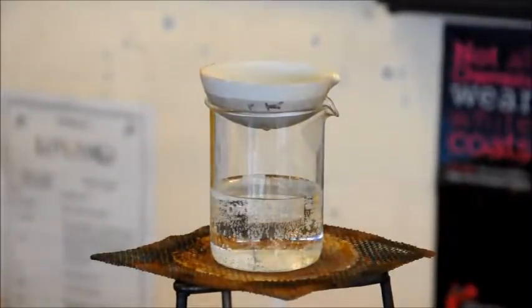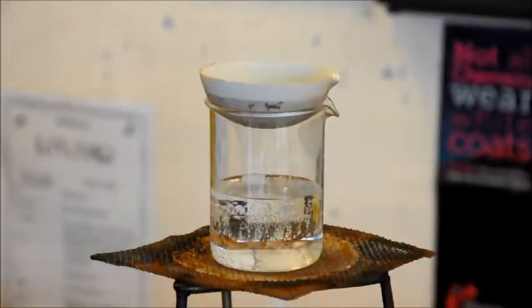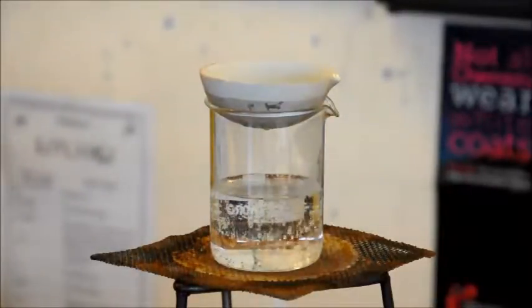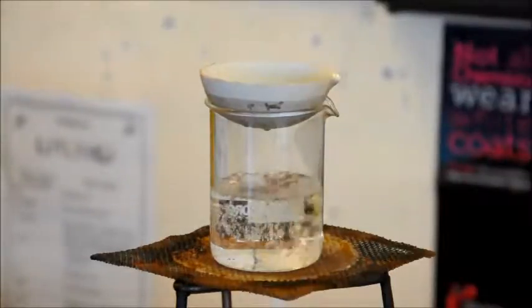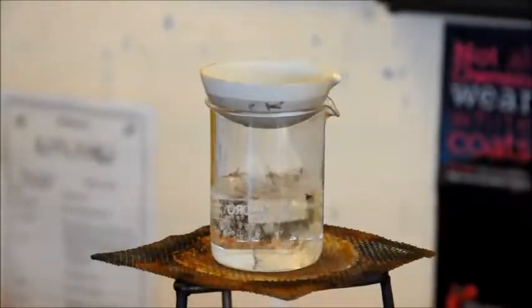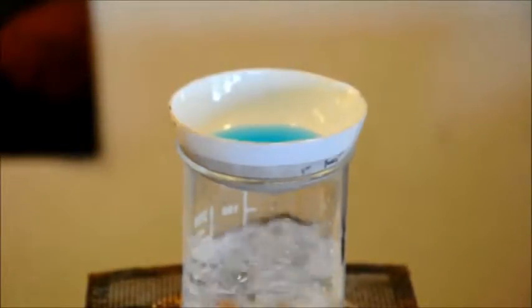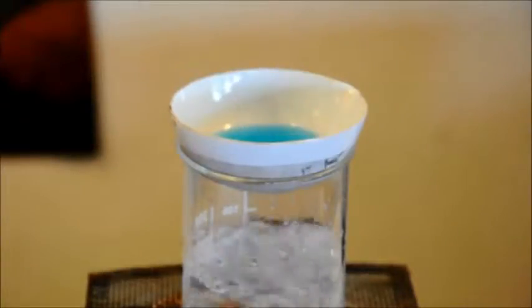Once the water in the beaker begins to boil, it condenses on the bottom of the evaporating basin, and the heat energy is transferred to the liquid in the evaporating basin. After a while, the water in there will begin to evaporate, and that's why we call it an evaporating basin. Right, after a while, the copper sulfate solution will begin to evaporate.